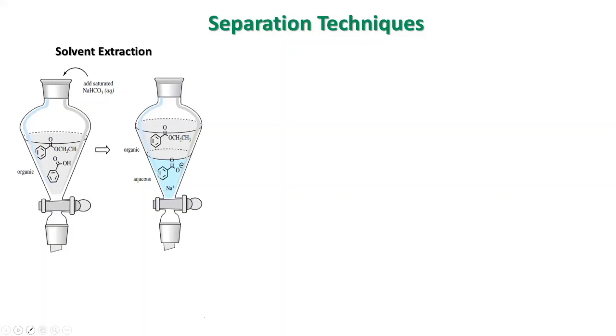So as we know, one of the very simplified techniques known to us is the solvent extraction technique. Now here, what we do is, you may have a mixture, and that mixture has compounds of different properties. They have different behavior of being dissolved in different solvents.